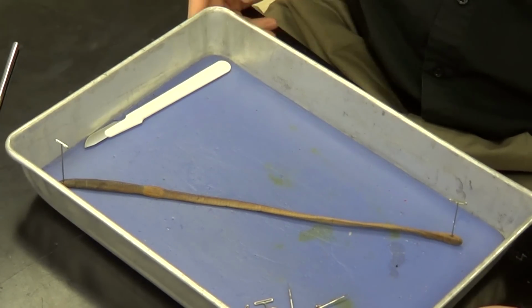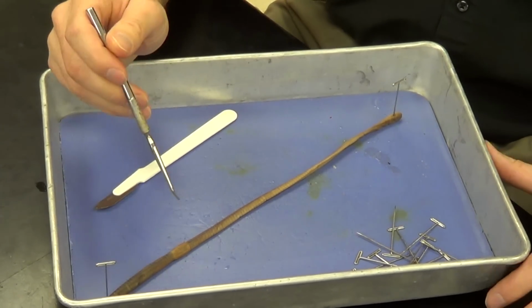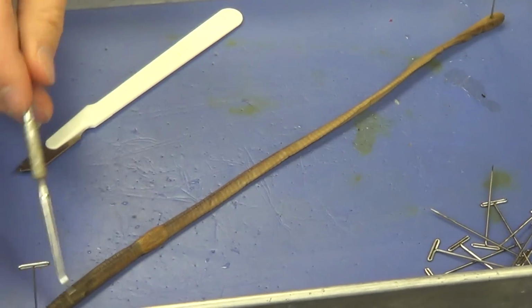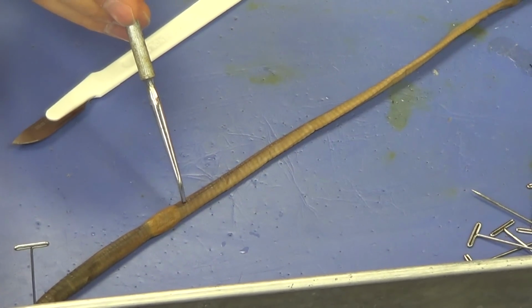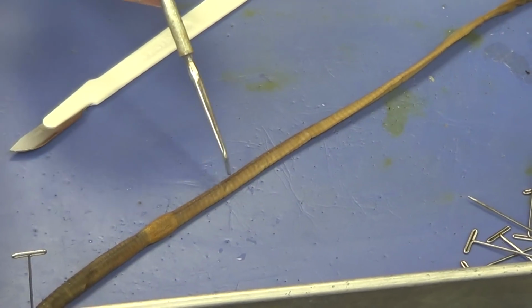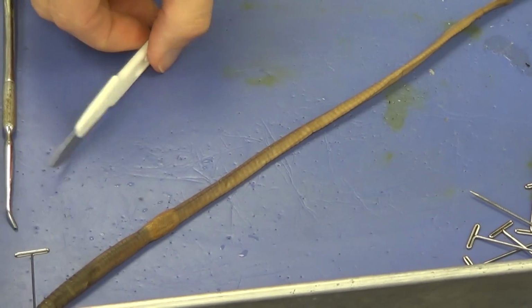So now we're going to go ahead and get to our dissecting. So we've got our scalpel. Note the clitellum right here. I want you to begin your dissection posterior. So anterior is headward, posterior is towards the anus. I want you to start posterior to the clitellum, because the only structures in here are essentially the intestine. So this is where I want you to practice. And if you make a mistake, it's not going to be too terrible. So we're going to start dissecting there.